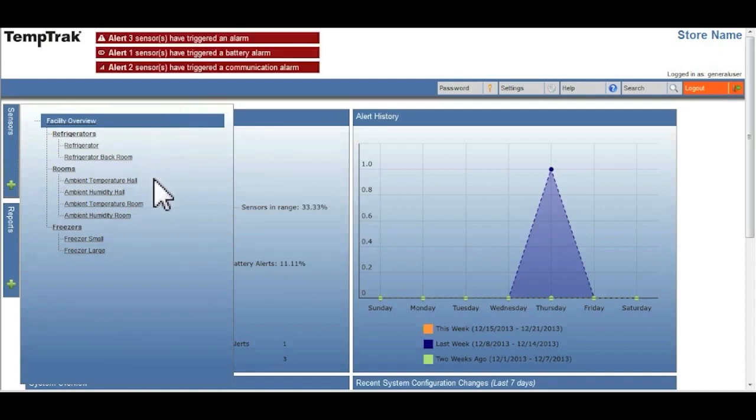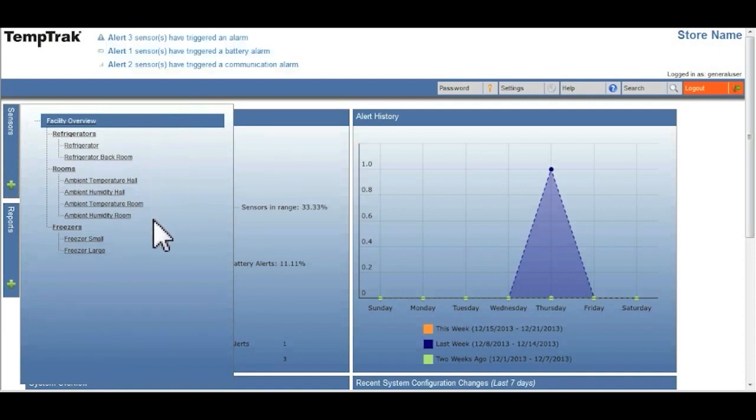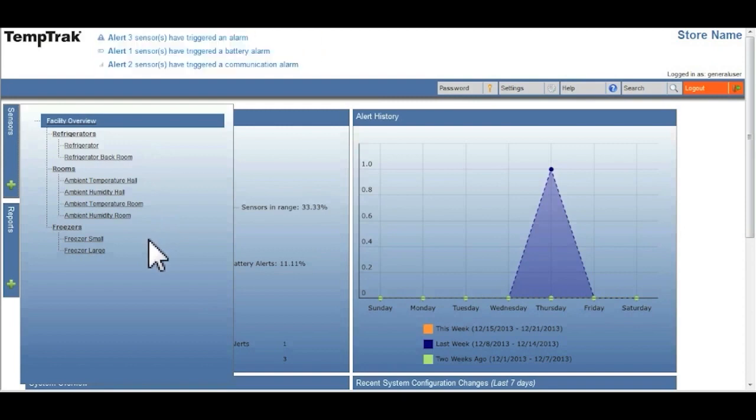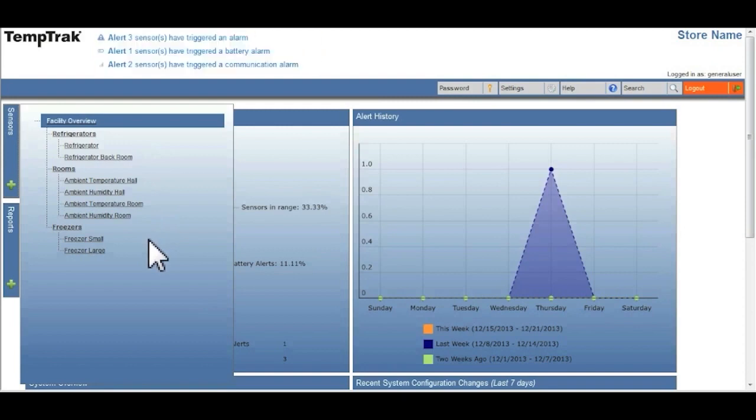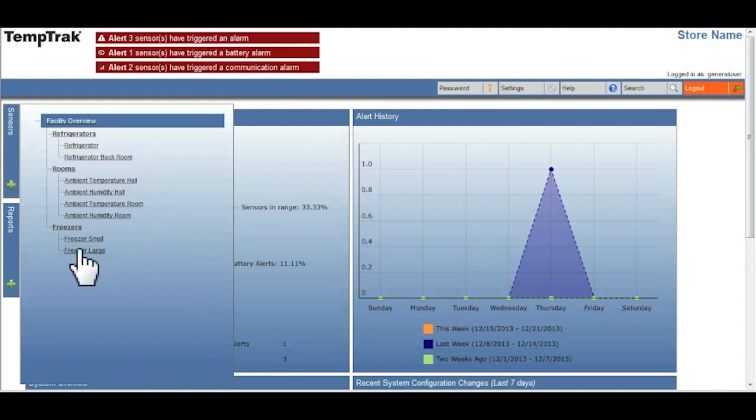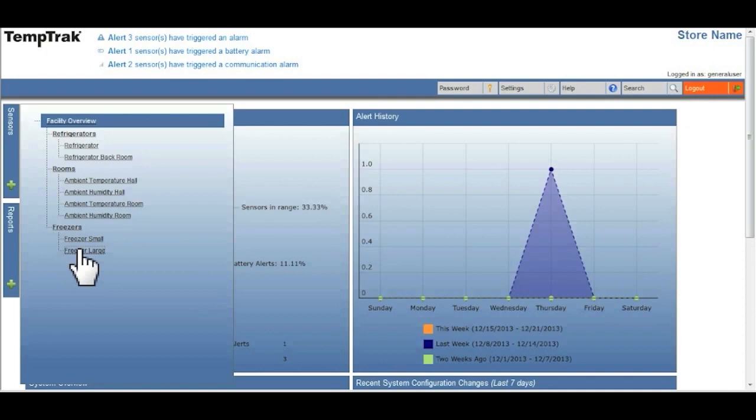When you select any one of the sensors, a page will appear that outlines a variety of different information.